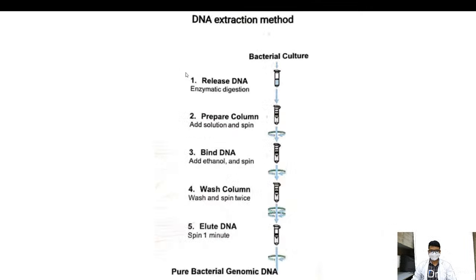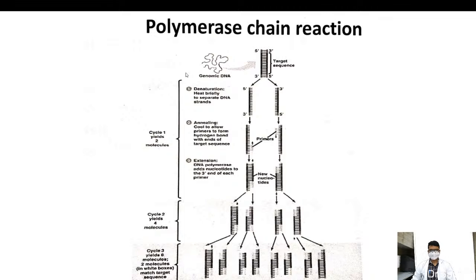So there are many instruments that are used. Here, this is the flow chart where, as I said, first they get denaturated. Two strands are separated over here. Then we will be cooling it and annealing, where the primers get attached to the specific sites.